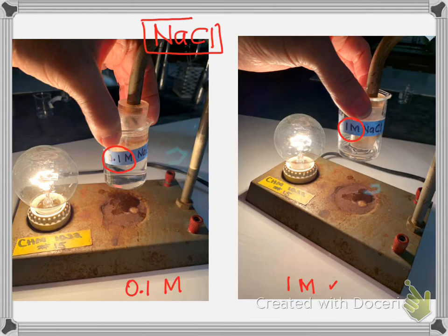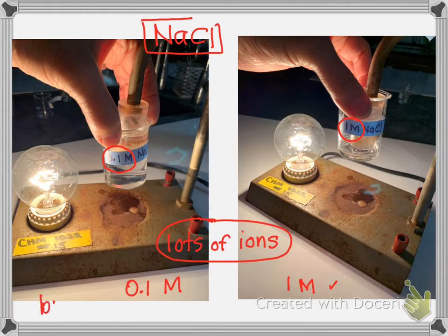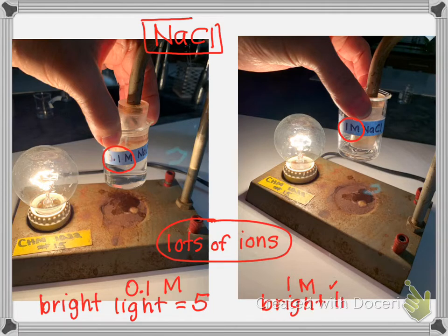Now, both of these light bulbs look very, very bright, which tells me they have lots of ions, because it's ions that make it conduct electricity. I really can't see the difference between the two, so I might give this a 5. This is a bright light, which means it's a strong electrolyte. Or you could say, I'm going to give it a 4 because I don't know if it's the brightest, and that would be okay. I'll give this one also a bright light, a 5.